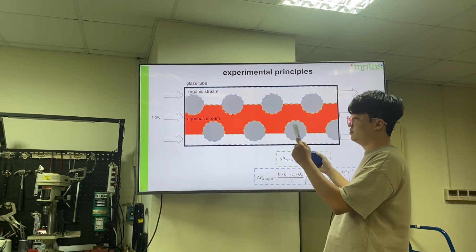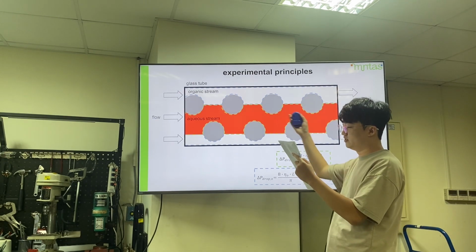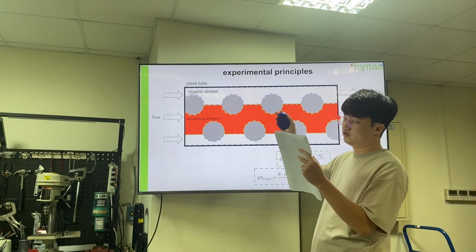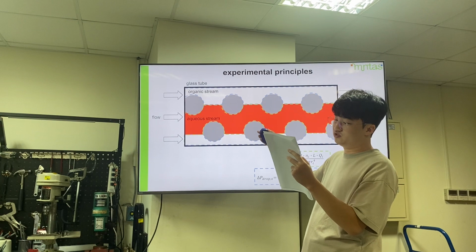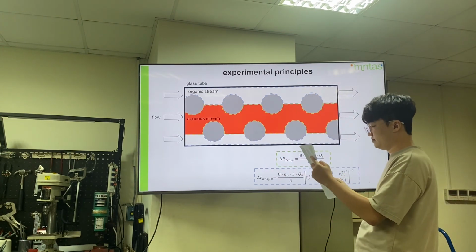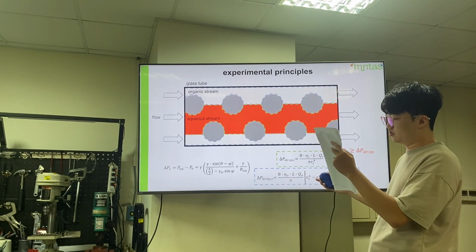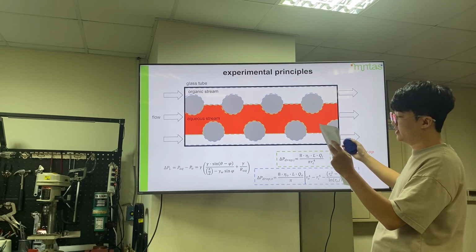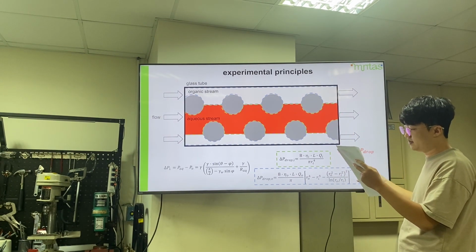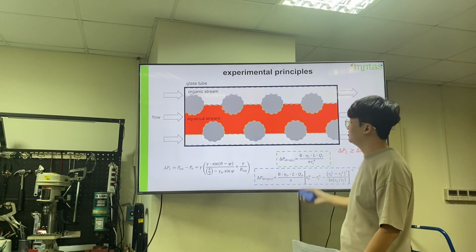The pressure drop arises from the friction between the liquid and the channel. In our experimental setup, which employs a closed flow system, there are separate pressure drops for the aqueous and the organic phases. For equilibrium at the liquid interface, the Laplace pressure must exceed the total pressure drop to maintain the internal fluid within the helix wire.